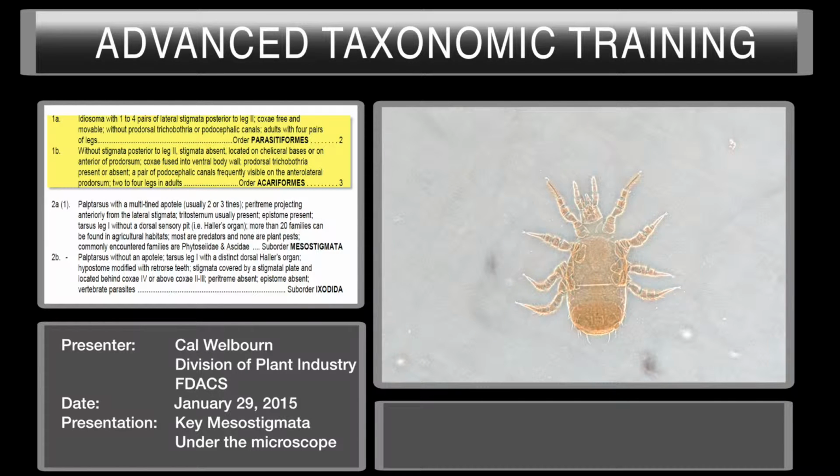Okay, we're going to continue with the general key. We're going to look at some groups that we haven't looked at before. At this level of magnification, most mites look almost the same, and that's where a lot of people have problems just separating them into the major groups. That's what we're going to concentrate on this morning.